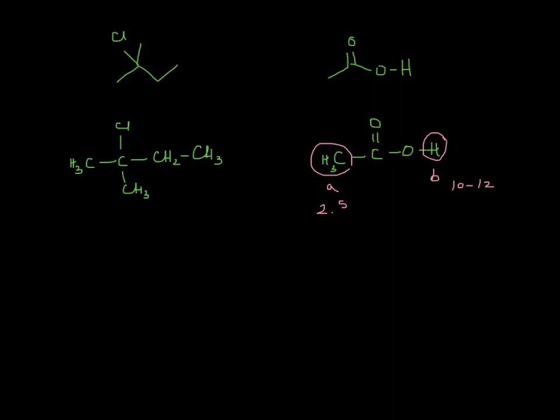We have chemical shifts corresponding to roughly where we expect them to show up. And the last thing to do for now is to look at the integral. The one on the left has 3 hydrogens, which will all be the same, so they'll all stack on top of each other. So the area under the curve here would integrate to 3. So we're going to say that this is 3 H's.